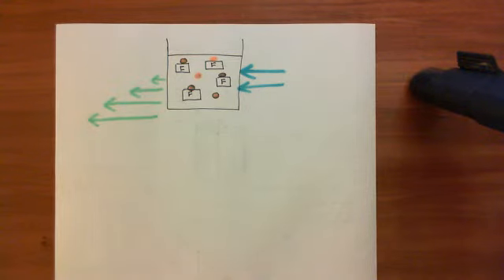And don't worry if you're a little bit fuzzy with it at the moment, we will see it in much more detail, because we now need to try and actually work out calcium concentration from a fluorescent signal.